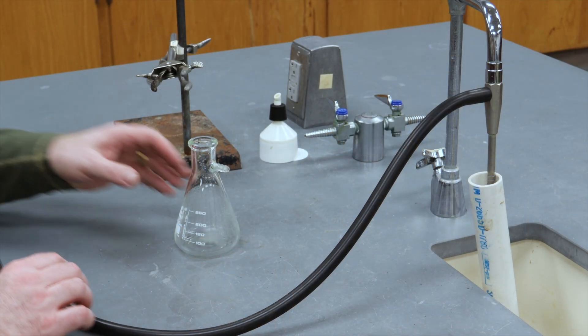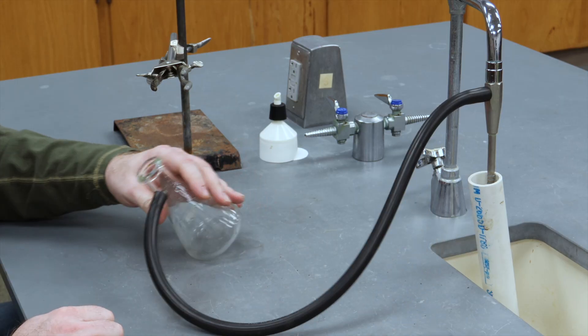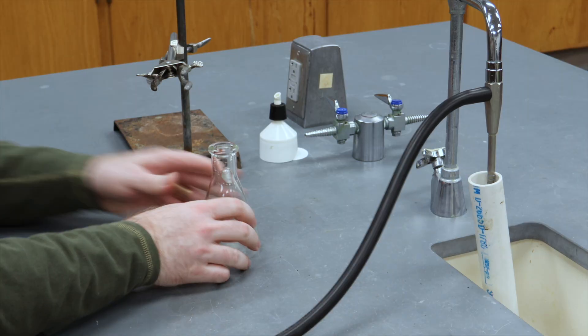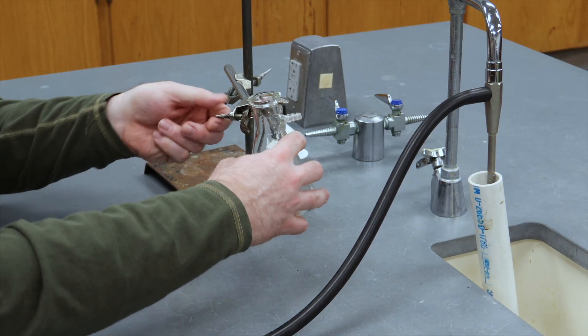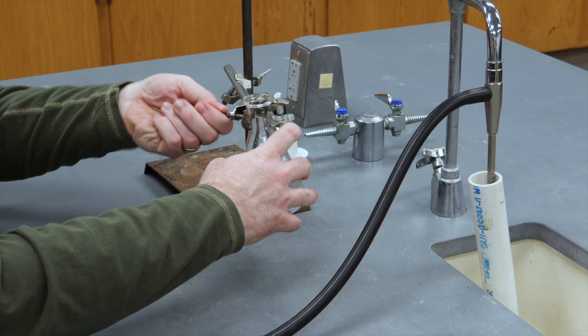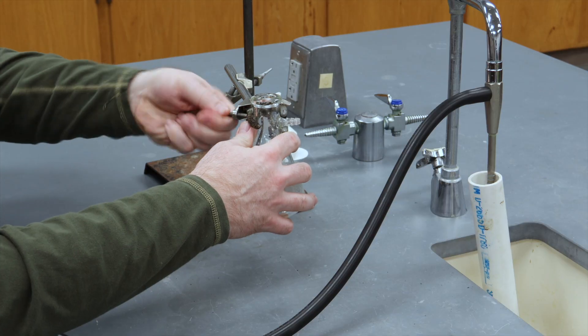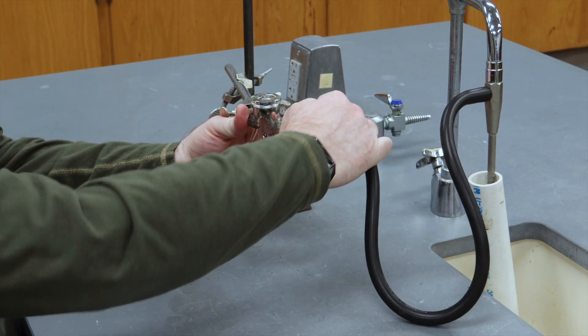Once you attach your rubber hose to the vacuum flask, it is not uncommon for the rubber hose to apply a force to the flask, which might make it fall over. A quick fix for this is to simply attach the vacuum flask to a clamp. I recommend doing this for any vacuum filtration with a relatively small vacuum flask.